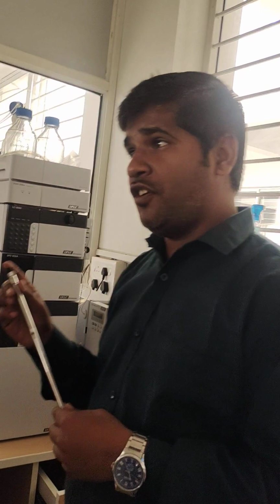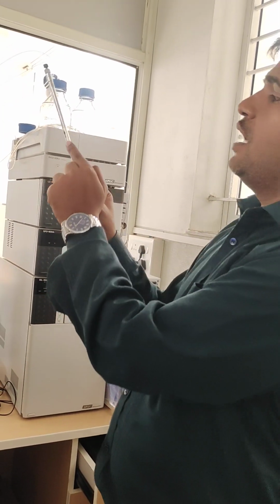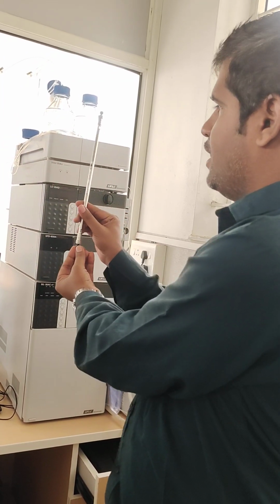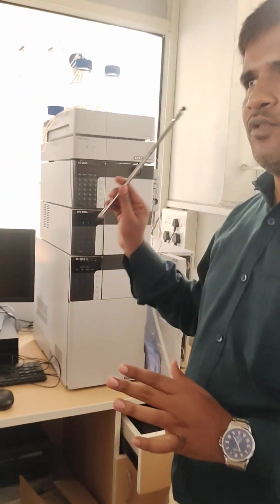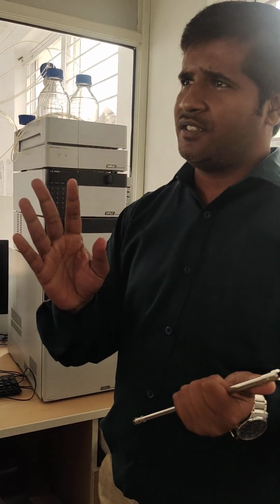Isn't it? I hope you are understanding this. The direction of the column is fixed in such a way that it has the upward direction. You have to attach the column from the bottom side, and the direction of flow will be upward. We have two columns. Both are C18 columns, because normal compounds are hydrophobic, and normal compounds are drugs, pharmaceutical drugs.